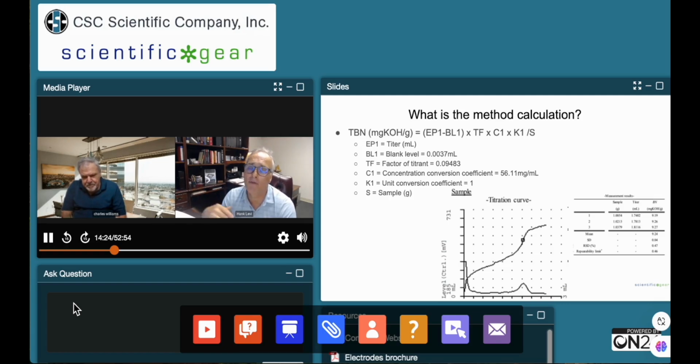So it's a great way to get your mind around it and say, yeah, I understand why the titrator is getting the answer. I can do it by hand. It works. It's a good habit to get into. And it goes for just about any titration, not just limited to this. It's a general equation.